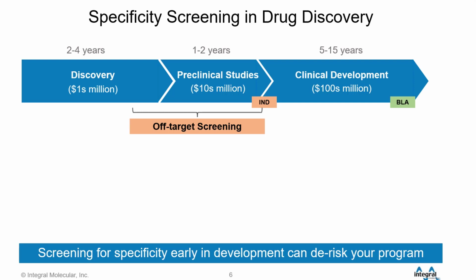Specificity testing is one thing you can do to help decrease the risk of drug failure. Even though specificity testing is required for IND, we do recommend testing drug candidates in the late discovery or early preclinical stage to give yourself as much leeway as possible.